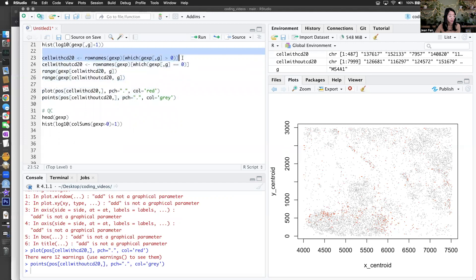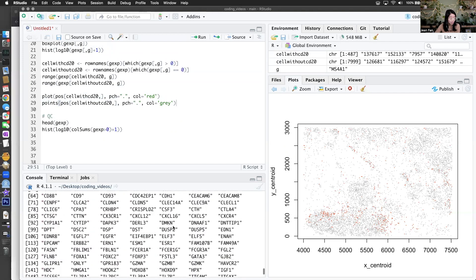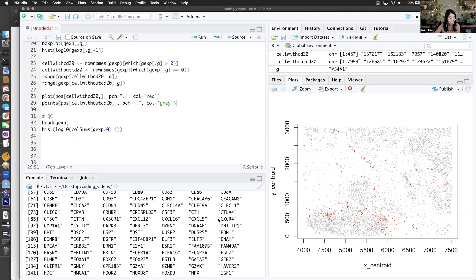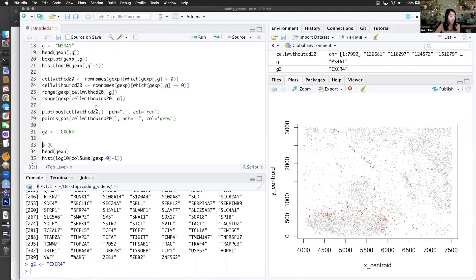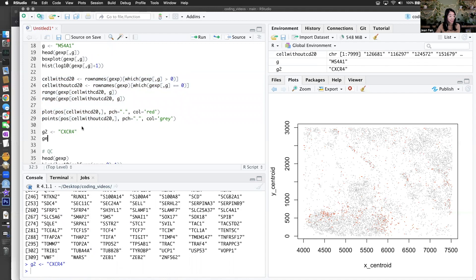We split it up into a vector of cells with CD20 and without. Maybe if we pick another gene — let's pick CXCR4. I want to see how these two genes relate to each other. I have my cells with CD20 and cells without, but do these cells also express CXCR4? That might be a biology question we're interested in. How would I use data visualization to explore that? How is this gene distributed?